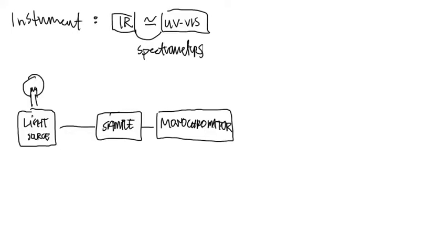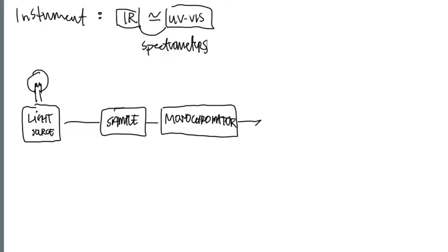After the monochromator, it then probably goes to some type of detection source. So we have a detector, the eyeball of the machine right here, like every spec. It's got to have something that it can see. And yes, that's supposed to be an eyeball. I know, I didn't go to school to be an artist.